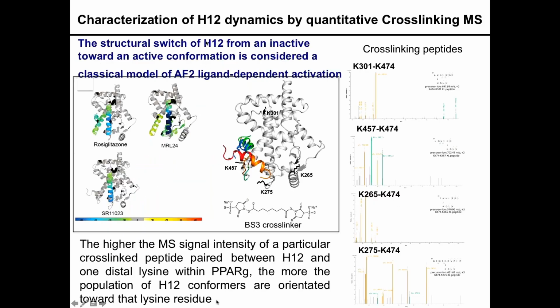The structural characterization of this helix 12 is very critical because this is ligand-dependent activation of this enzyme, and the structural orientation, the movement or dynamics of this helix is very important for enzyme activation. However, in our deuterium exchange experiments, in the presence of agonists we can see protection in this helix, and partial protection in the presence of partial agonists. However, in the presence of antagonists or inverse agonists, we can't obtain any information in terms of HDX protection around this region.